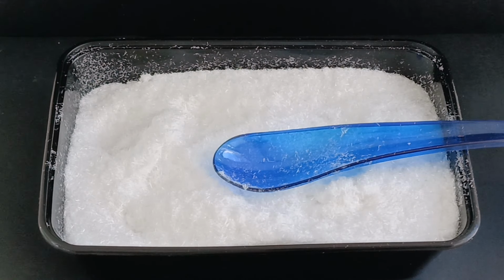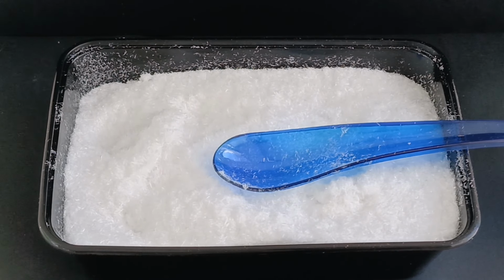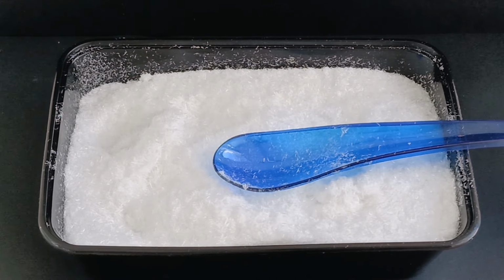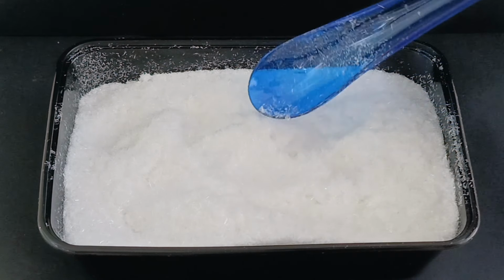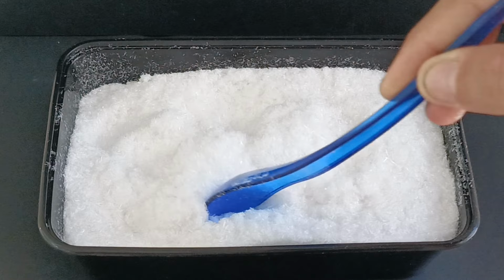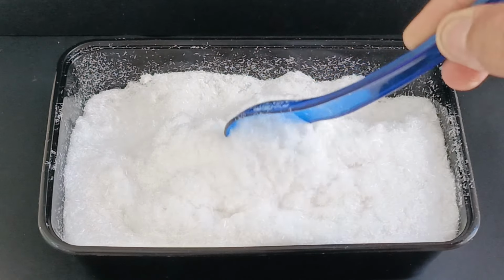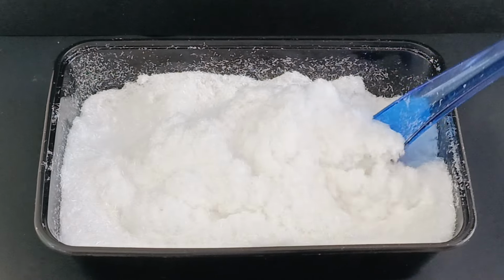I then repeated this entire process 3 more times for a total of 200 grams of acetylsalicylic acid. In the end, I was left with 144 grams of salicylic acid, which corresponds to a 94% yield. This yield is extremely good for me, and it's primarily because I used a lot of water for the hydrolysis and I let it run for an hour, which is twice the amount that was required for the procedure.